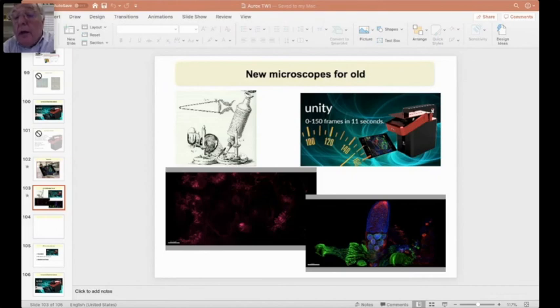It's a thing we in Oxford used, we came up with the confocal, if you like, because we like mathematics. And if you stick a pinhole in the equation, it becomes a delta function, and the integral is easy. So we actually had a thing called a type 1 microscope, which was the regular scanning microscope, and a thing called a type 2, which was the scanning microscope with the pinhole, which of course is the confocal.